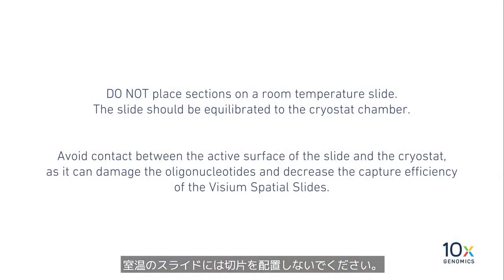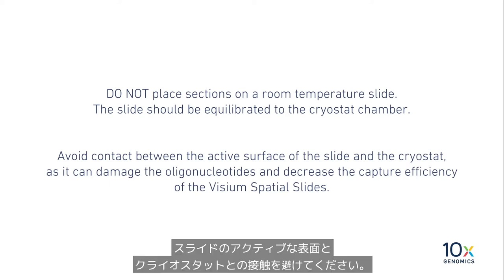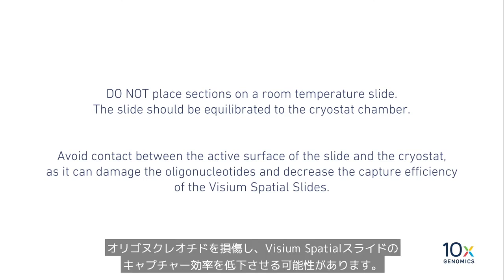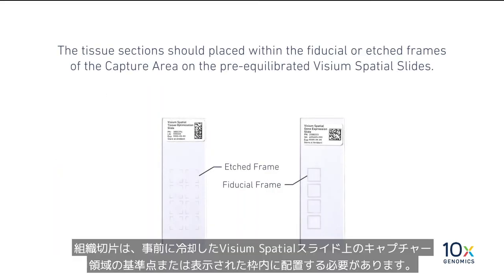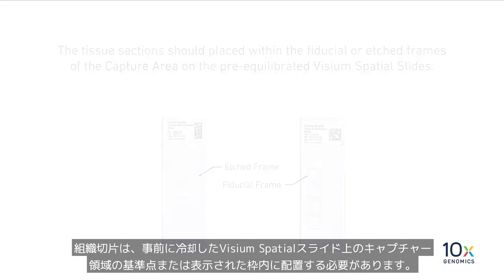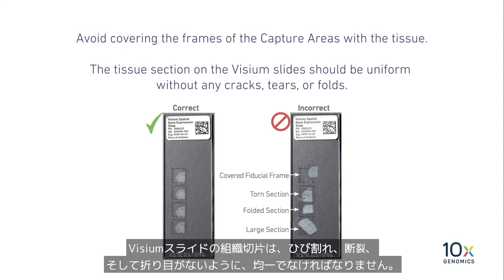Do not place sections on a room temperature slide. The slide should be equilibrated to the cryostat chamber. Avoid contact between the active surface of the slide and the cryostat, as it can damage the oligonucleotides and decrease the capture efficiency of the Visium Spatial slides. The tissue section should be placed within the fiducial or the edge frames of the capture area. Avoid covering the frames of the capture areas with the tissue. The tissue section on the Visium slides should be uniform without any cracks, tears, or folds.